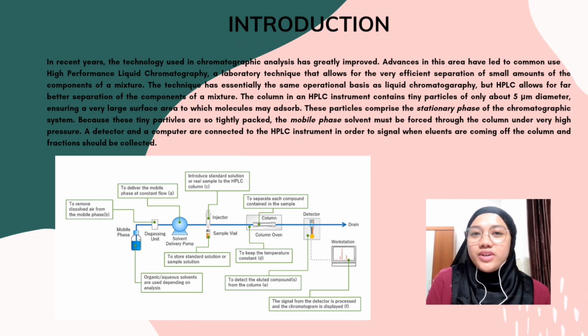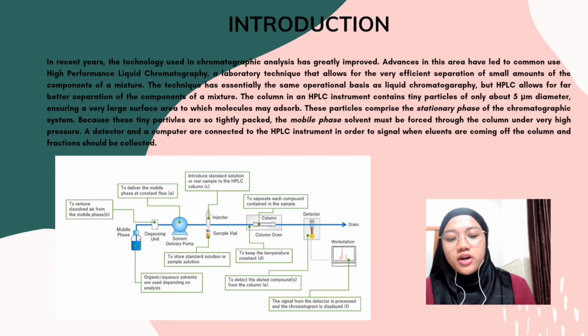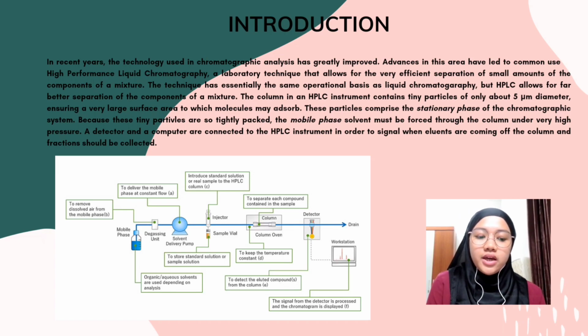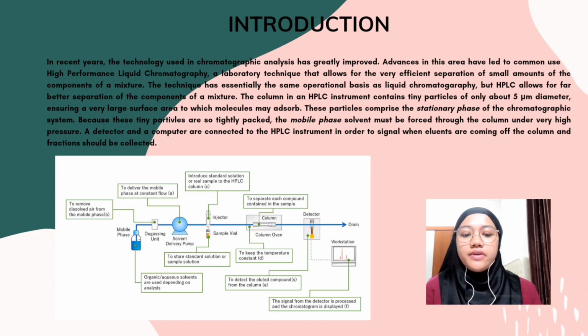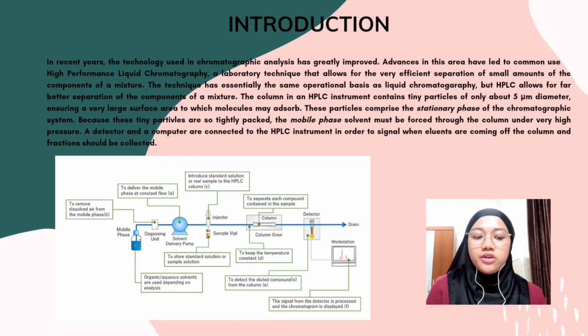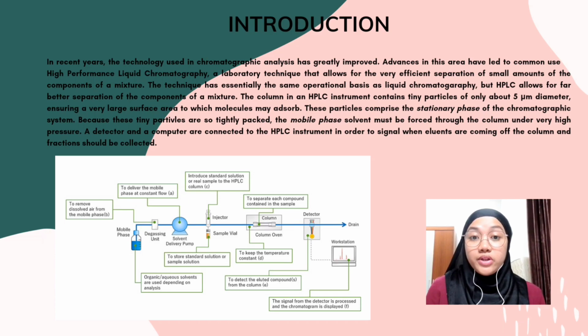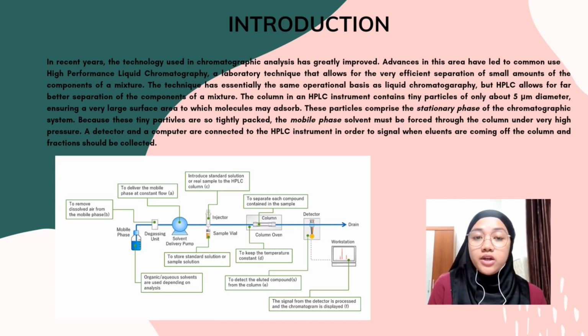Assalamualaikum warahmatullahi wabarakatuh. In recent years, the technology used in chromatographic analysis has greatly improved. Advances in this area have led to the common use of high-performance liquid chromatography, a laboratory technique that allows for the very efficient separation of small amounts of the components of a mixture. The technique has essentially the same operational basis as liquid chromatography, but HPLC allows for far better separation of the components of a mixture.